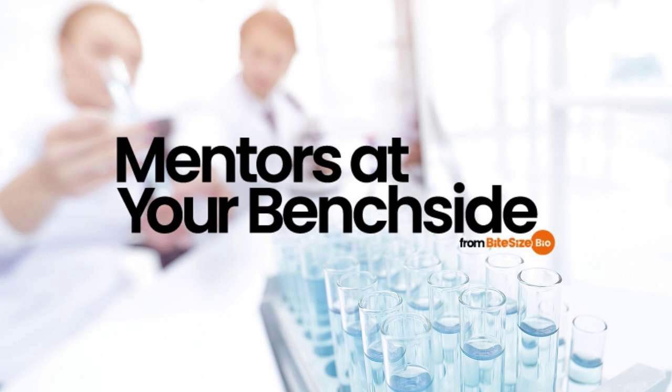Why should I fix my cells? There are many reasons why fixing your cells is a good idea. 1. It will allow you to run the samples when you're ready, e.g. when a cytometer becomes available. This is particularly beneficial if you're doing a time course assay or paying for cytometer access. 2. You'll be safer because your cells are no longer alive. In some labs, fixed samples may be mandatory. 3. It's usually convenient and easy. And 4. If the antigen or target you want to look at is intracellular, you'll most likely need to fix your cells in order to permeabilize them, allowing the antibody/dye to reach its target.